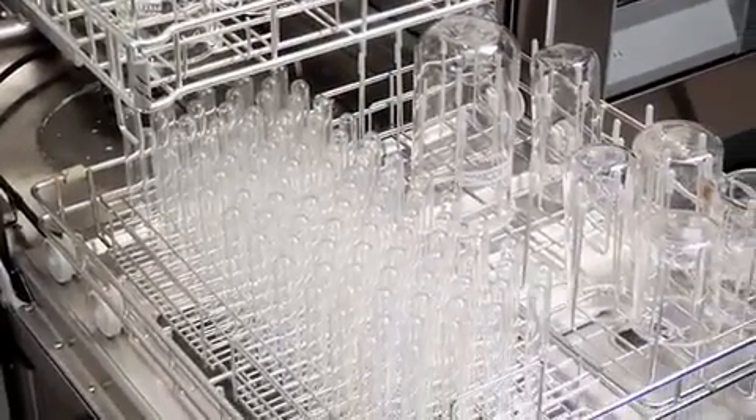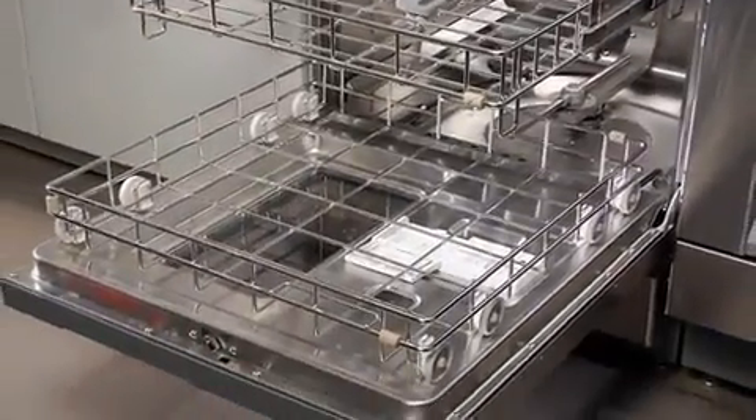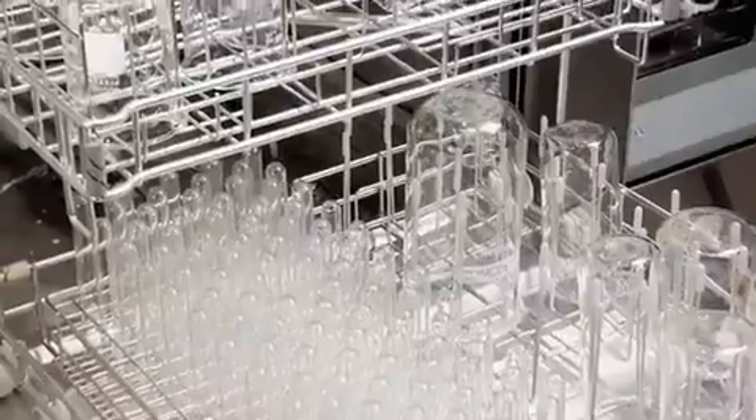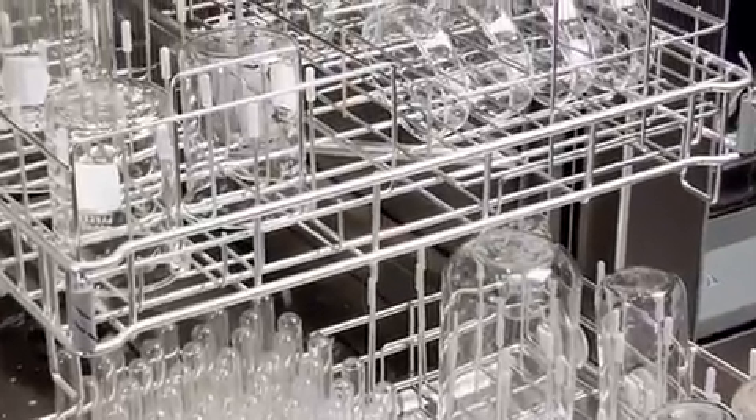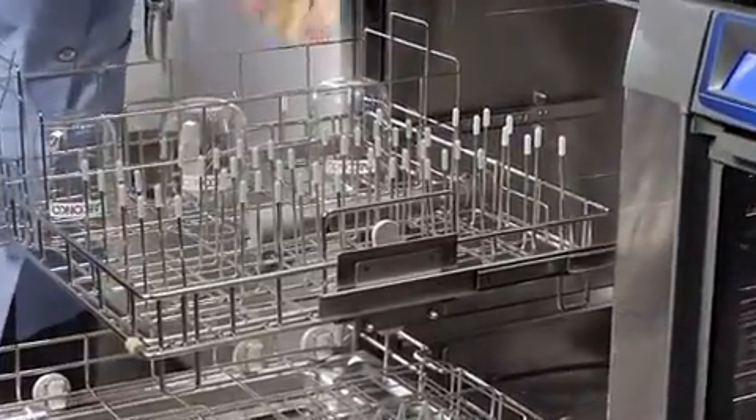The Steam Scrubber laboratory glassware washer cleans beakers and other general-purpose labware. Stainless steel top and bottom racks are included. Inserts for beakers and flasks, DNA sequencing plates, BOD bottles, Petri dishes, and culture tubes may be combined inside the Steam Scrubber.